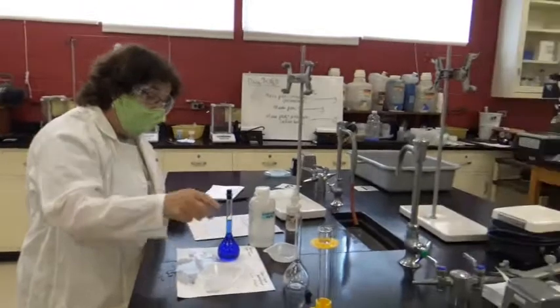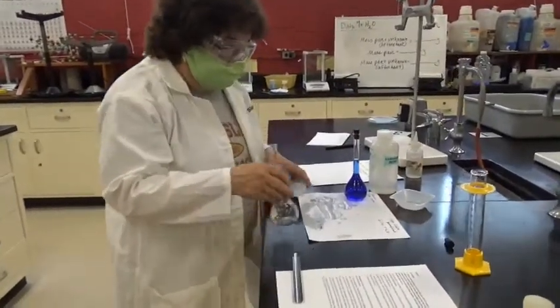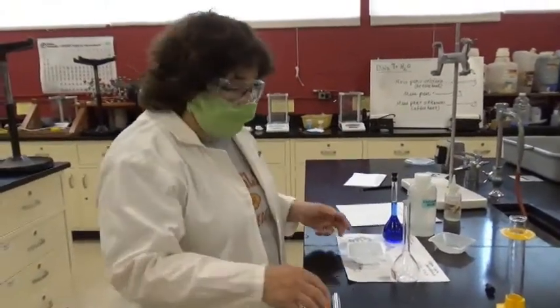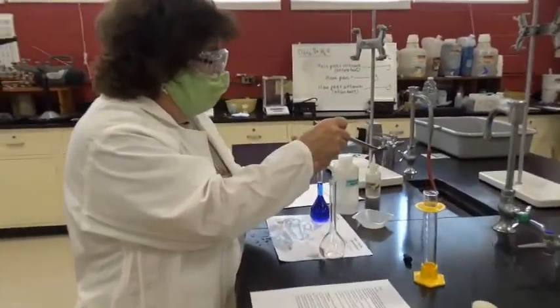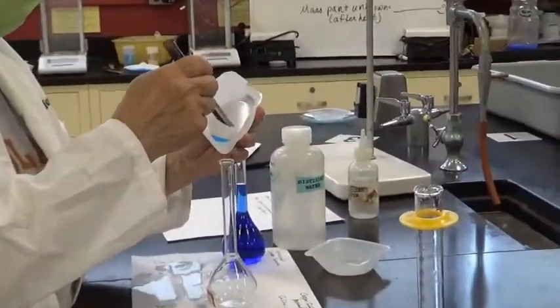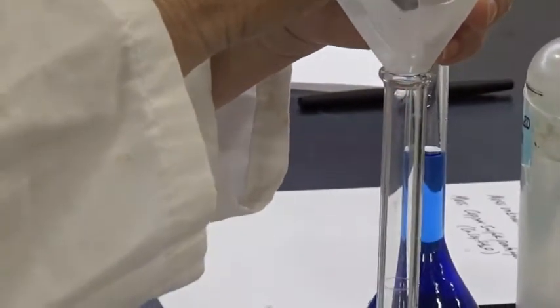All right, let's work on the next one. The next one is done exactly the same way. I'm afraid I made this all wet, but it doesn't matter. When you do chemistry, everything gets wet. I always say your papers have a little more character. So let's try that again. I'm going to try to put this in carefully so I don't lose any, because this was measured, and measurement is meaningful. Good job. There's nothing left in here, but I'm going to give it a little squirt.